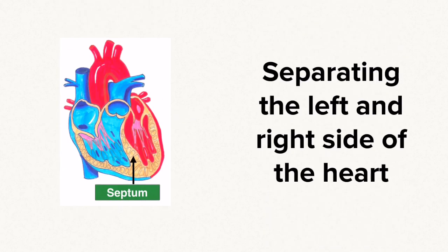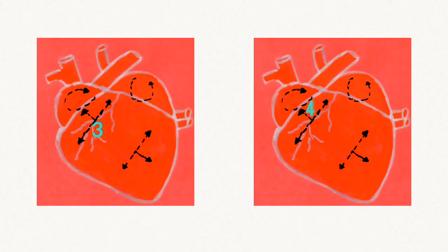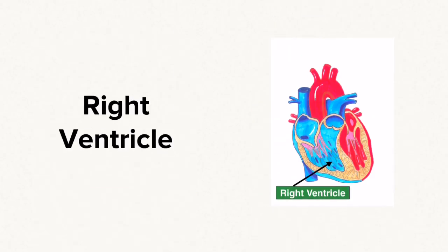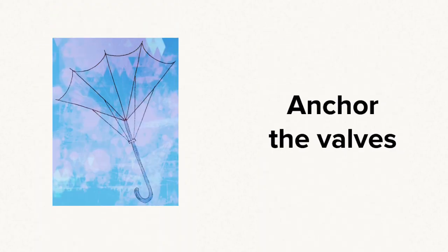You could add in at any stage that you noted the septum — the wall separating the left-hand side from the right side of the heart. Cuts number three and four led into the right ventricle and opened it up. Once again you noted those chordae tendineae — those heartstrings — also present in the right ventricle, attached to papillary muscles found at the base of the right ventricle wall. The purpose of those chordae tendineae is to anchor the flaps of the tricuspid valves to prevent them flapping back up into the right atrium.